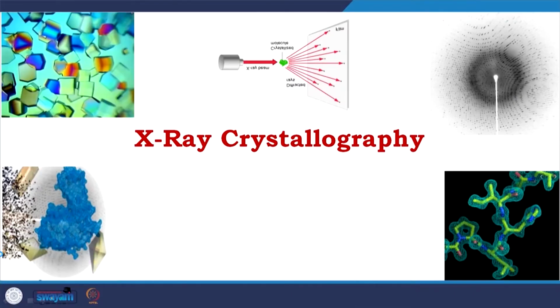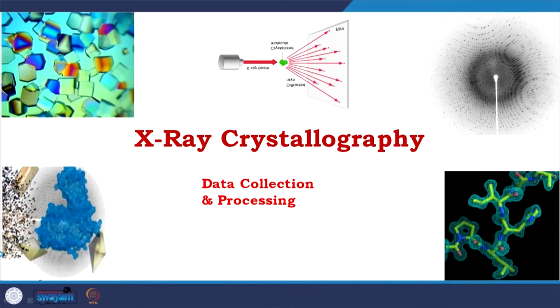Hi everyone, again welcome to the course of structural biology. We are continuing with the structural biology techniques, and again in structural biology techniques we are talking about X-ray crystallography. Today is the last class of the module, and in this class we are going to discuss data collection and processing. But before that I would talk about the journey so far.